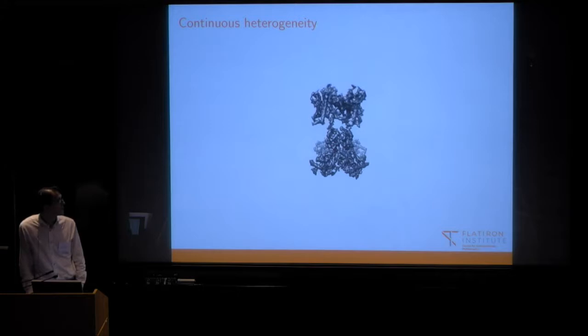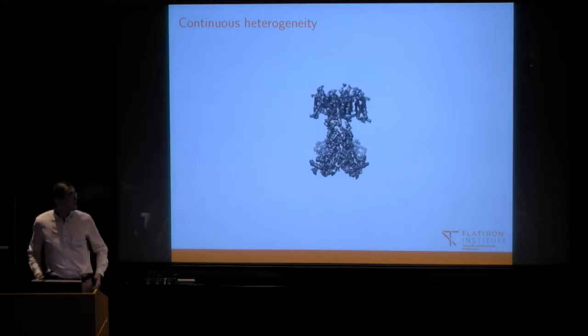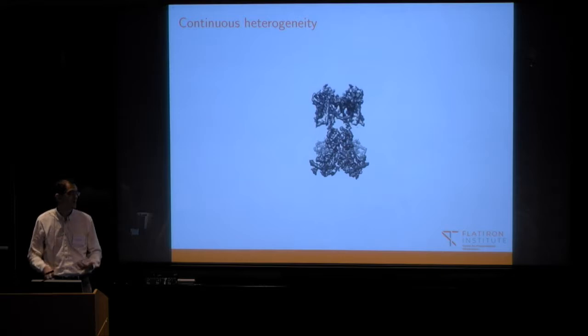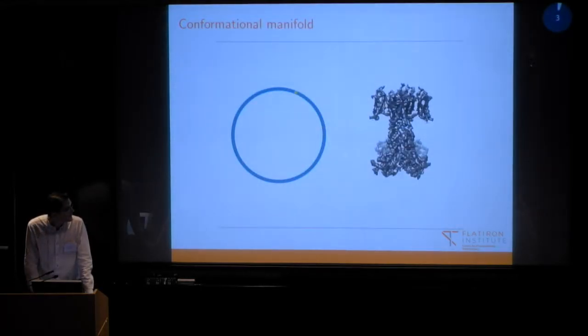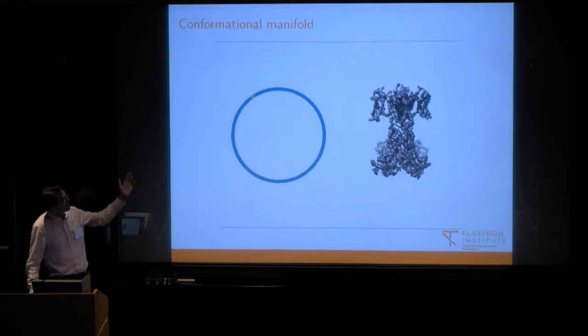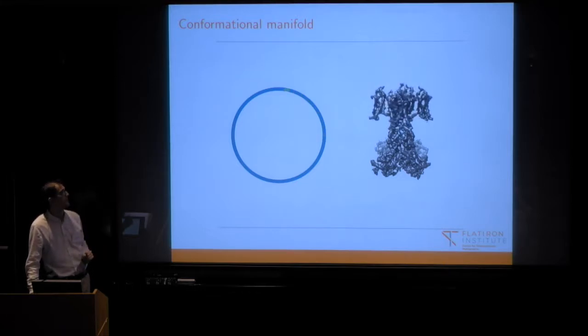This is something that we want to try to figure out because often we'll have molecules that move in a certain way, and the way that they move can have an effect on the function. And so this is something that biologists want to find out. So the way we're modeling it is basically what Joakim Frank was talking about yesterday: we're thinking that we have some sort of parameter space on a manifold, and that a point on that manifold maps to a specific volume that we're interested in reconstructing.